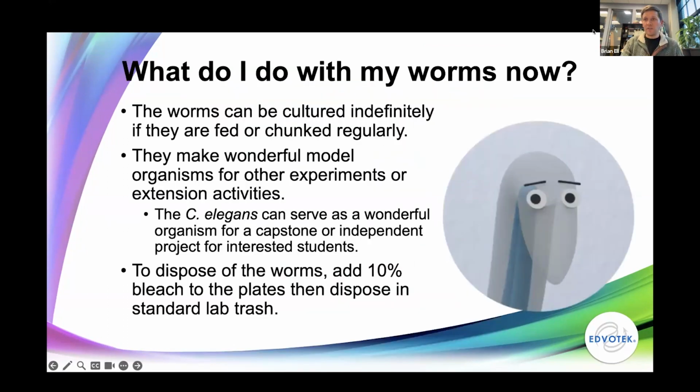Okay. Final thing then, what do we do with the worms now that the assays are done? As I mentioned earlier, the worms can be cultured indefinitely. As long as you're feeding and chunking them, you can continue these cultures more or less indefinitely. They do make wonderful model organisms for other experiments or extension activities. So if you want to use them in a capstone or independent project for interested students, you will have them available. You can continue these cultures along, have the students continue the cultures along, and they work out really well for that. If you are done with them, to dispose of the worms, we recommend adding just 10% bleach solution to the plates, letting it sit for a minute or two to make sure everything is dead, and then they can be disposed of in standard lab trash.